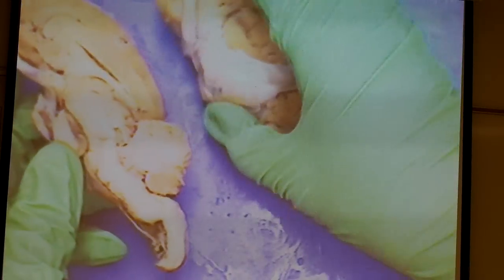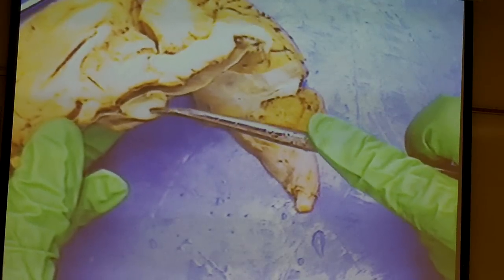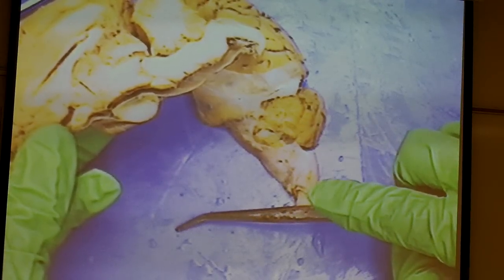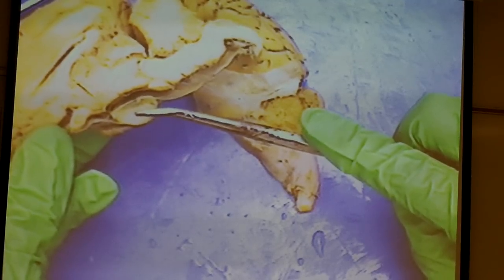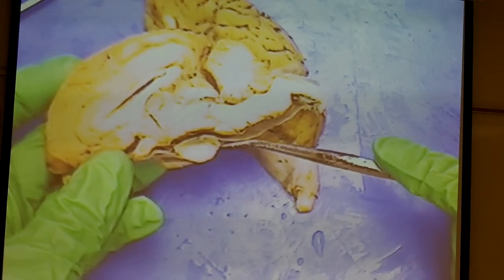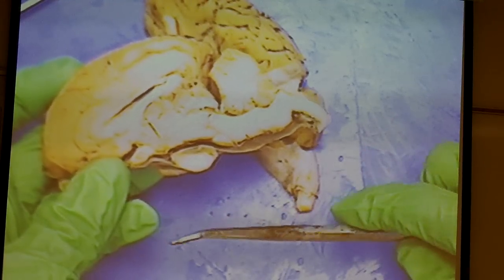If you don't have any meninges left, you probably don't have this structure, but this little thing down here is the pituitary gland. You cannot tell just from looking at it if it's anterior or posterior pituitary. The anterior is also called the adenohypophysis, and the posterior is called the neurohypophysis — it's an extension of the hypothalamus.